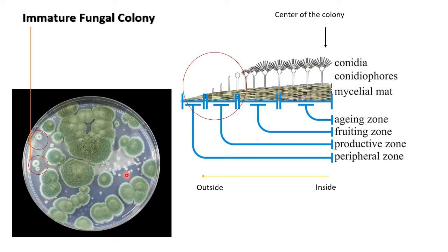What's the difference here? These small colonies are white in color, which means there is only mycelial growth present — there is no conidiophore or conidia. In case of these colonies which are slightly bigger and the center is green, it means there is a small amount of conidiophore present with spores or conidia at the center. The periphery — the outside — is where hyphae or the mycelial mat is present, which is growing continuously and spreading out. That's the reason these are the immature colonies.